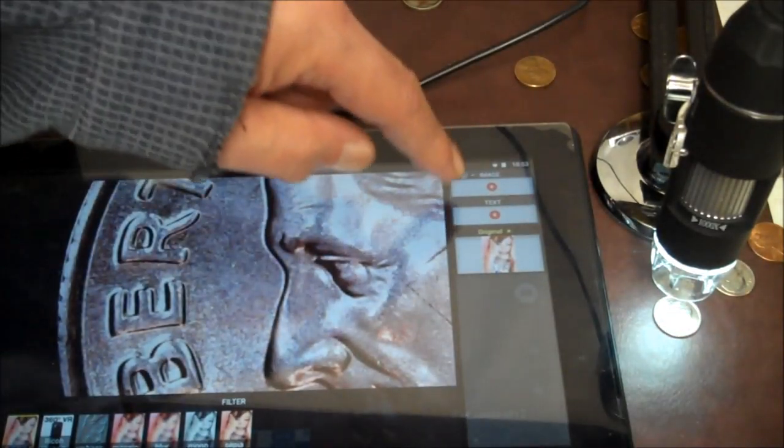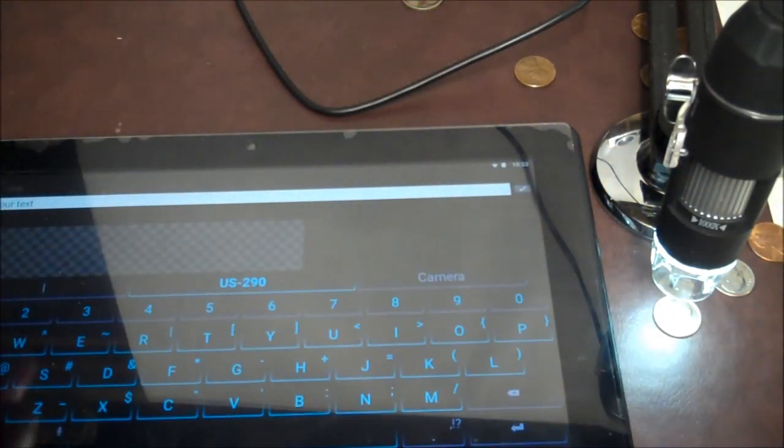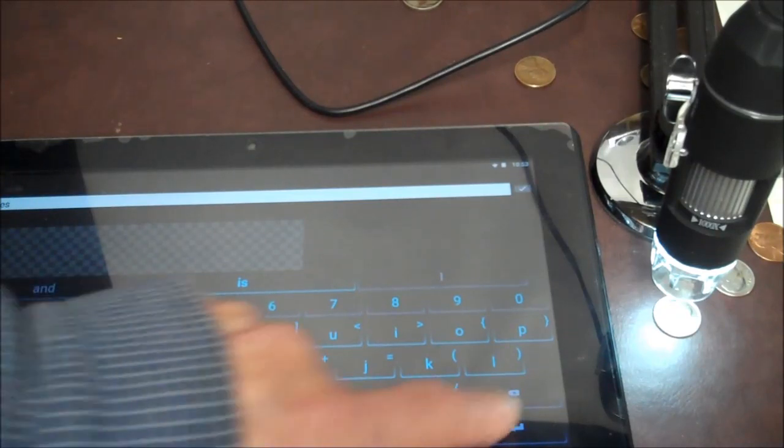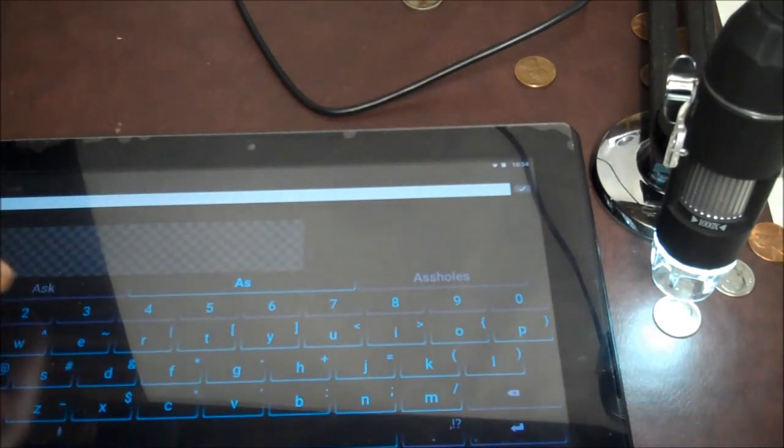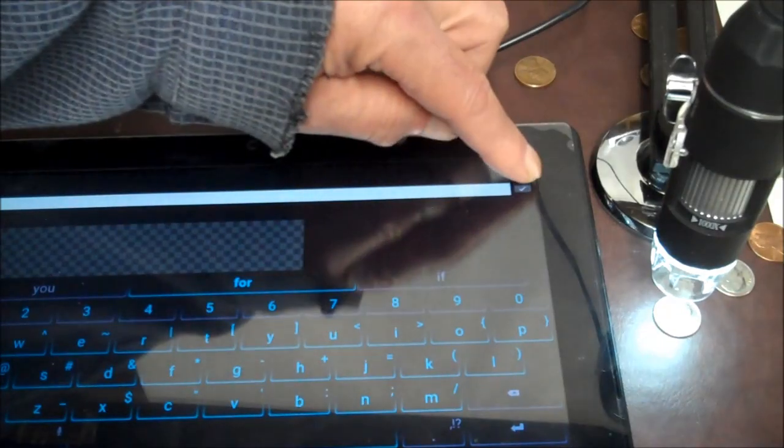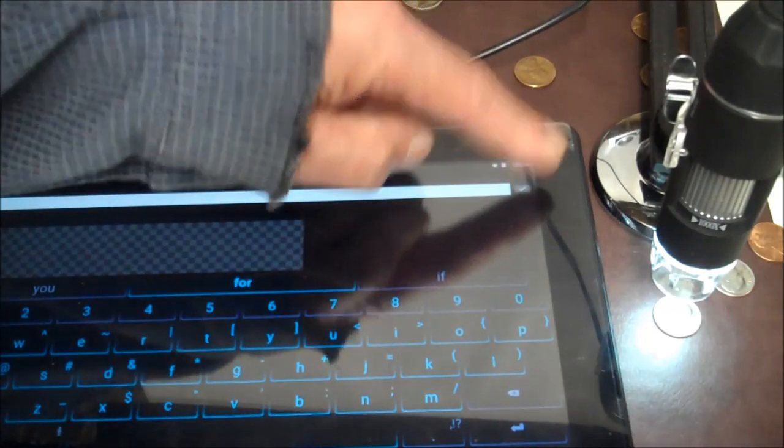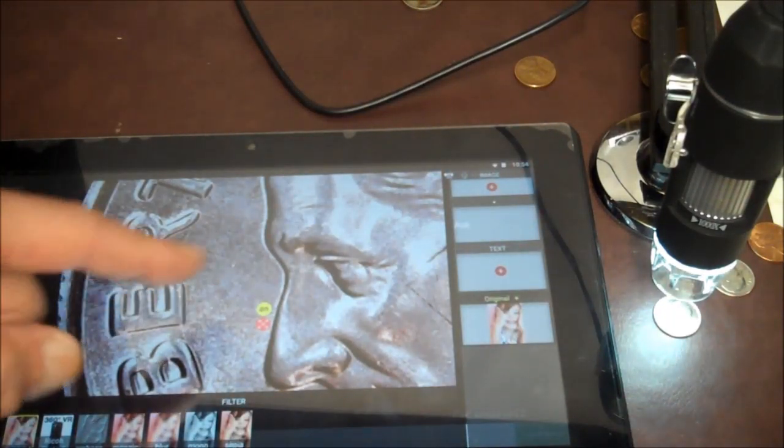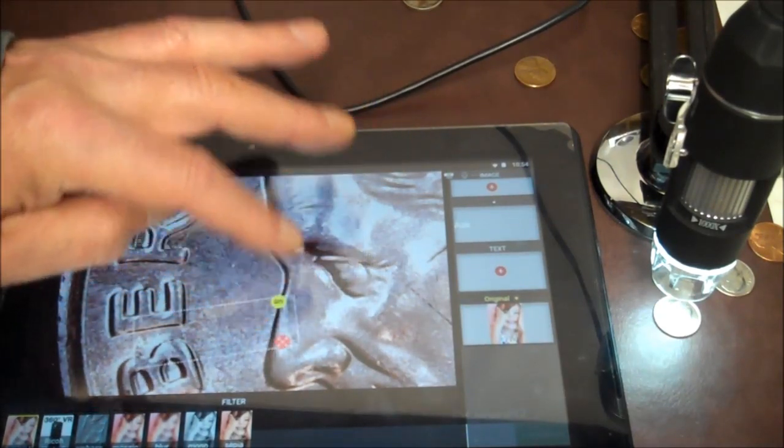And of course you could add text. Just type in your text. ASD. Space. Not assholes. I didn't type that. I typed ASD. Okay. Oh boy. Then you press check over here. And it goes on your picture. Not too good I might add. But you can spread it out by this button here.